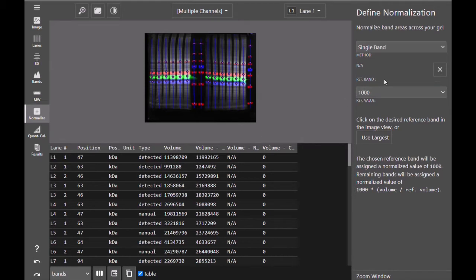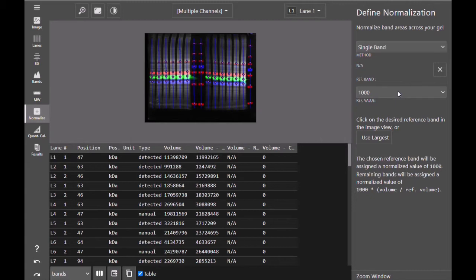With single band normalization, you can select a single reference band within your image, assign the reference value for that band, and then Azure Spot Pro will normalize all of the other bands in your image to the signal in that reference band.